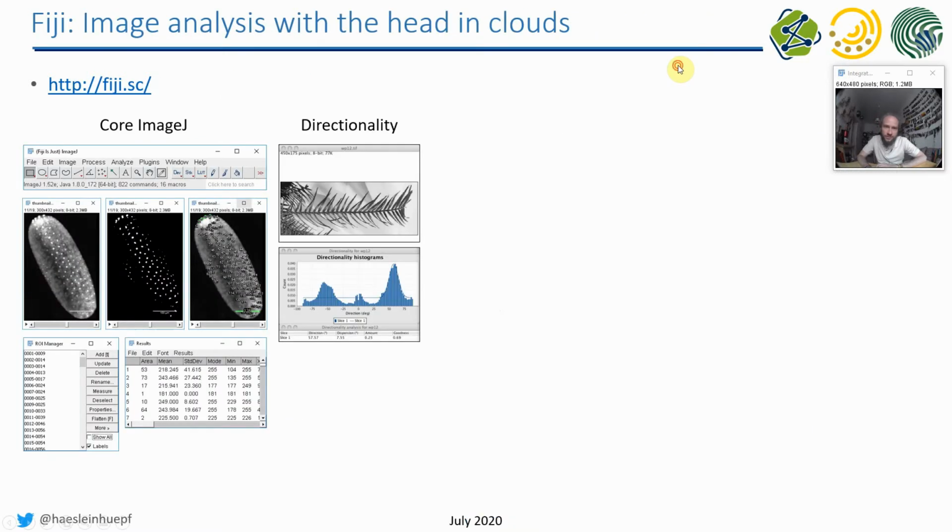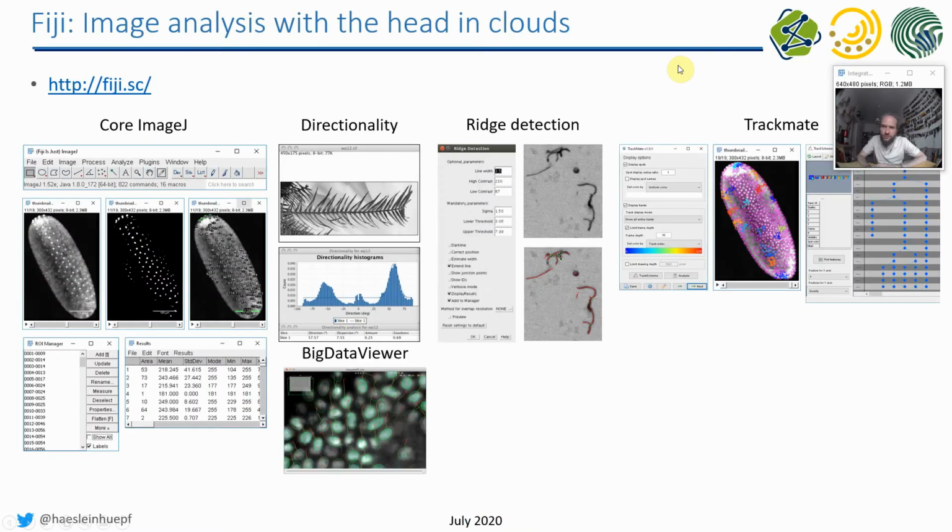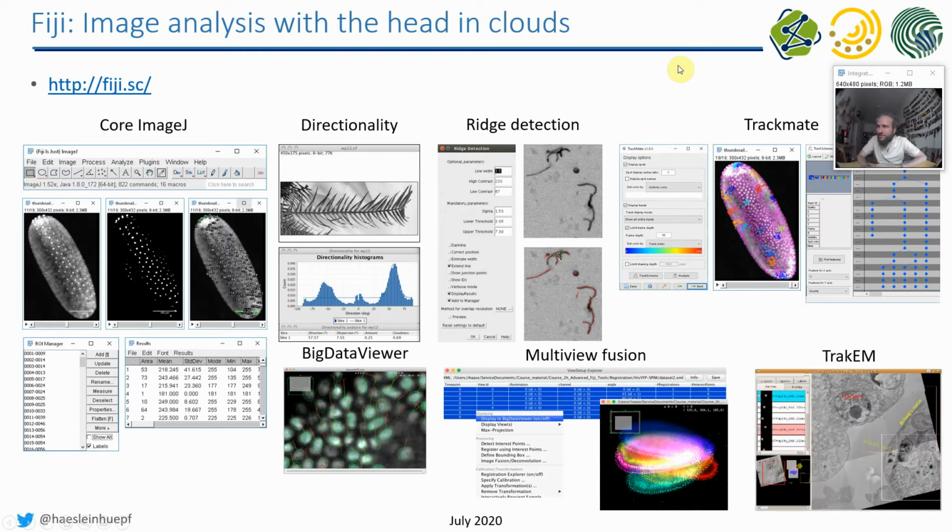Furthermore, I showed you a lot in ImageJ and Fiji, so I do basically everything in Fiji. So if I tell you you should use Fiji, then you should have in mind that I am biased because I do everything in Fiji, but it may not be the right tool in all the cases. But I'm very confident in Fiji. That's why I can do all the things in Fiji. It's possible that you, after using KNIME for a year, can do everything in KNIME. So that has really something to do with you, the environment around you, and practice.